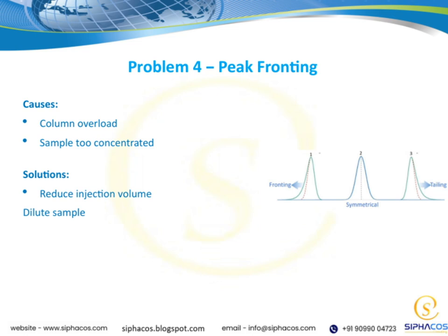Alternatively, diluting the sample makes it less concentrated, which helps achieve a more symmetrical peak. These solutions are important because they help us improve the accuracy and reliability of our results, keeping our chromatography running smoothly and our data trustworthy.